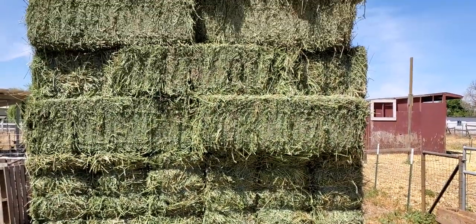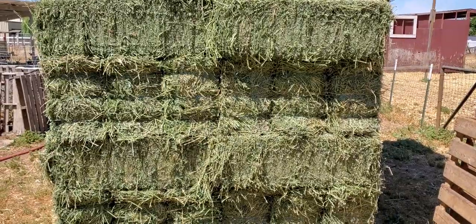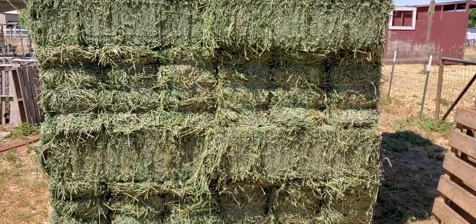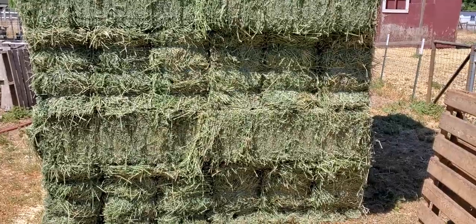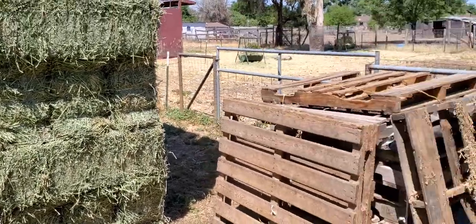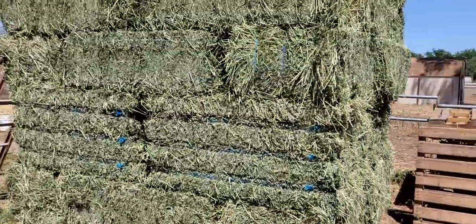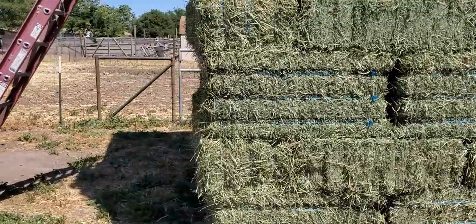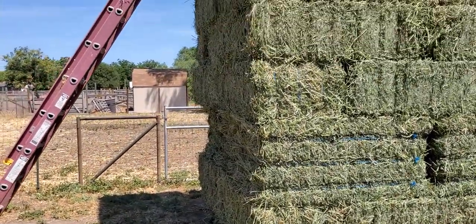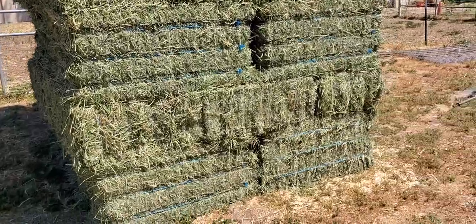Here's the stack of hay. I'm just going to go over how to sample, and I'm going to show you one sampling, but then I'm going to actually climb up — I'm going to use a ladder to sample all the way, because you want to take about 20 different samples. So I'm going to climb on that ladder up there, but I'll just show you one first.